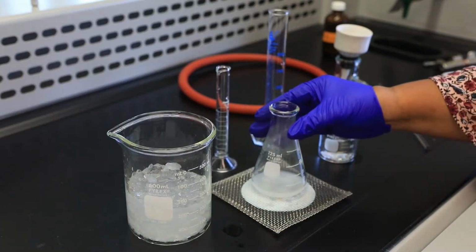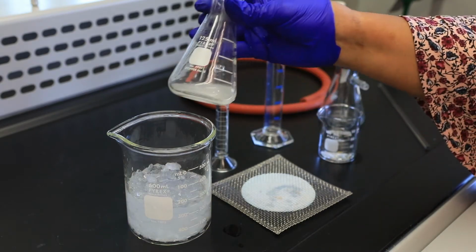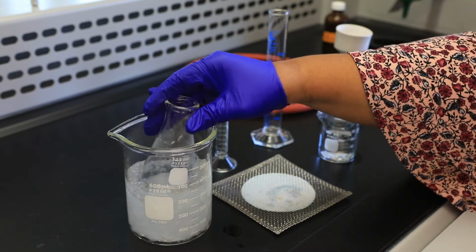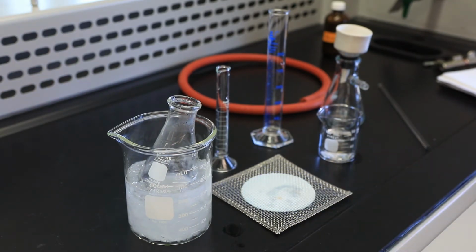So after adding the 10 mLs of chilled water, I'm going to transfer my reaction product to the ice water bath to allow us to crystallize our sample. And that will be here for approximately 15 minutes.